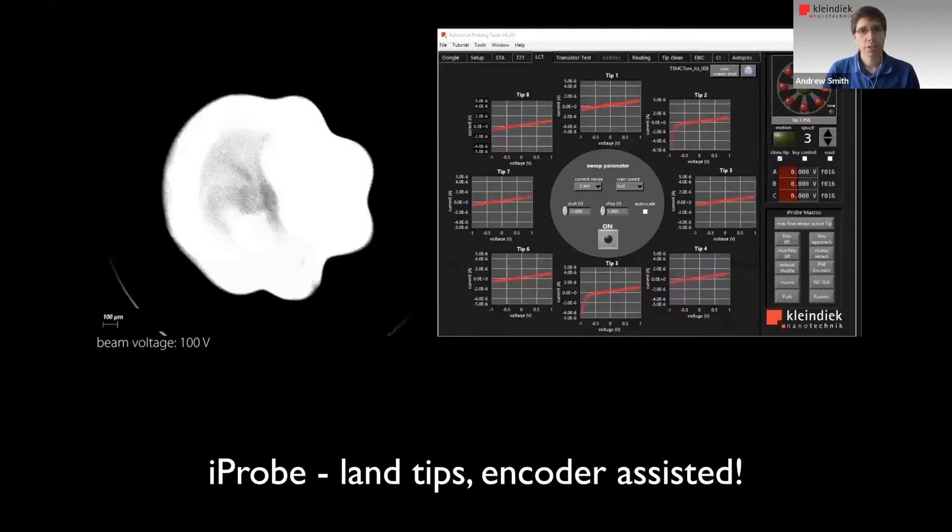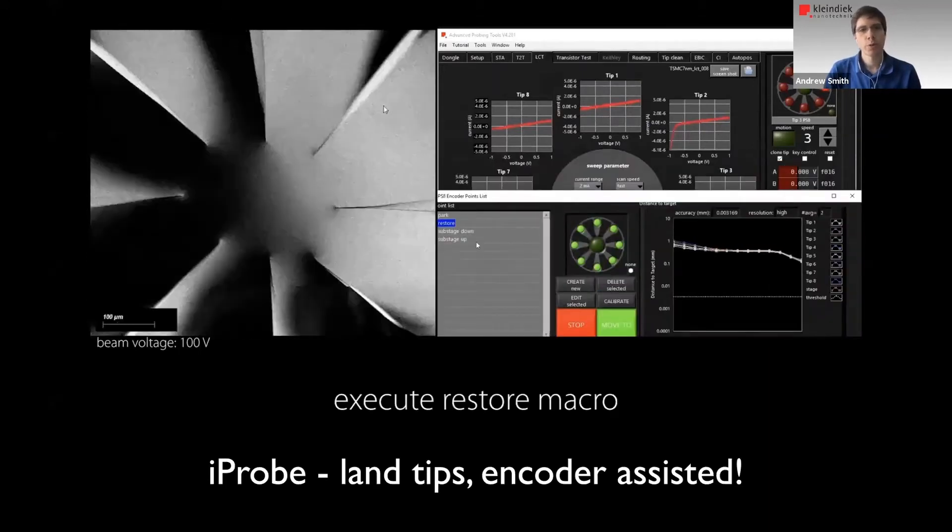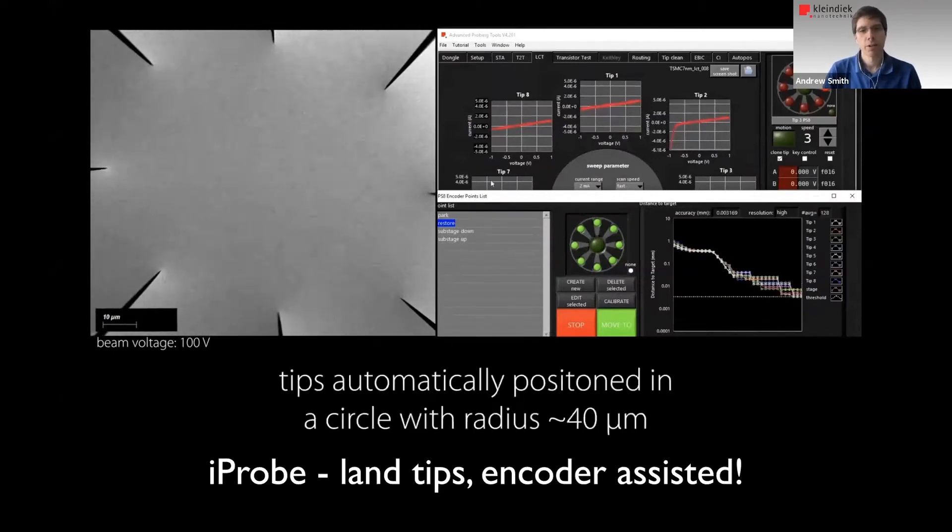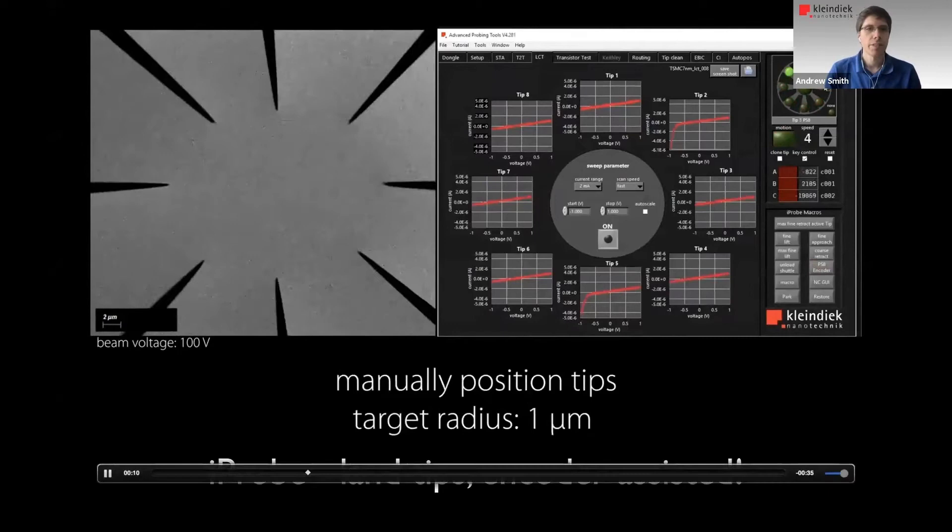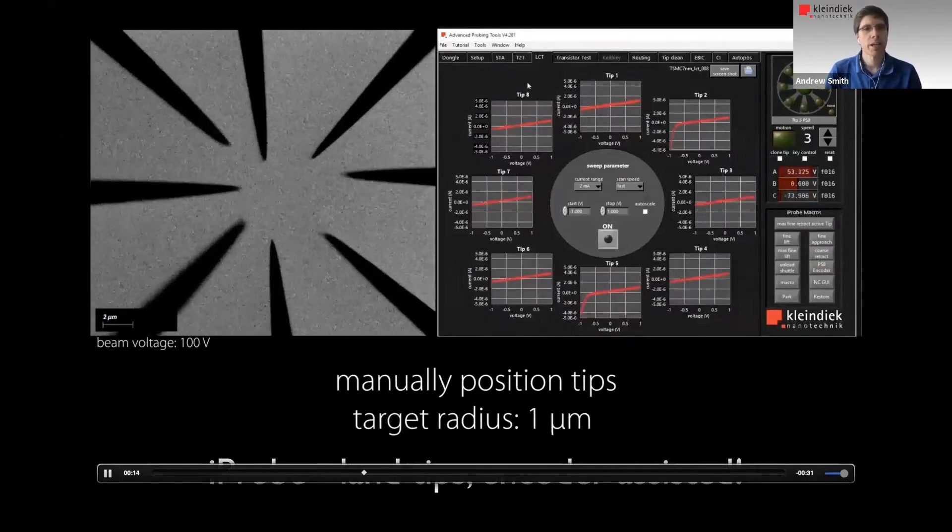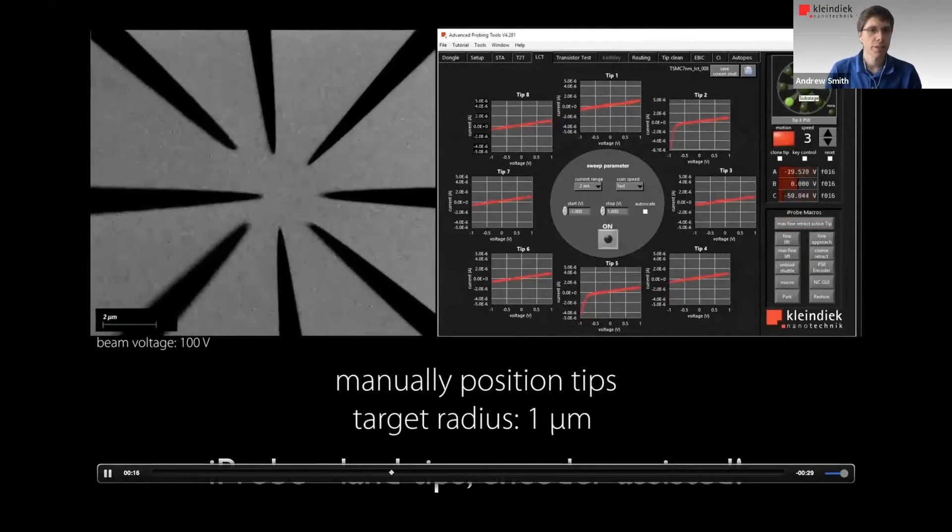So again, automated workflow. That's what we're trying to discuss. And we can see here, this whole sequence that we're going to watch now, of course, it's a time lapse, but it was done at 100 volts acceleration voltage. And I'll talk about this in a second, but let's focus on the left side, which is the SEM image. And the first step is to restore the probes from their parked position into the working position or starting position, and this is a radius of approximately 40 microns.